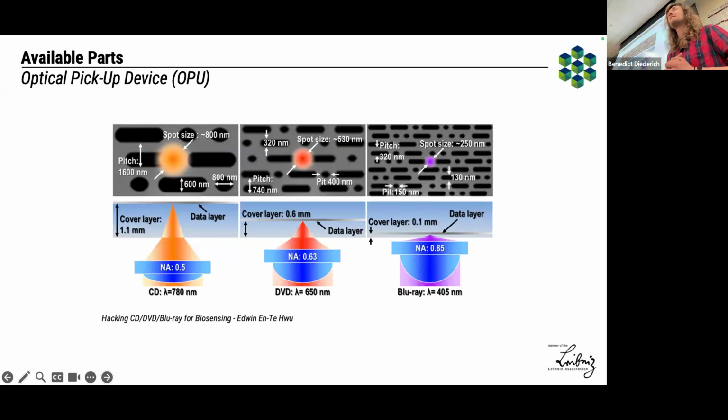Maybe some of you still know what that is, but there's very cool optics involved there. The way it works, you probably know, is a disc that's rotating. You have little information embossed in the silver film, and you have to read it out somehow. And it's basically a confocal microscope because you focus on this thing and read it out. They are actually diffraction limited, let's say. So you're working at the physical possible limit to squeeze as much information on the disk as possible. That means while it's rotating, it's wobbly because it's not perfectly flat. You have to maintain the focus. You have to maintain perfect focus quality.